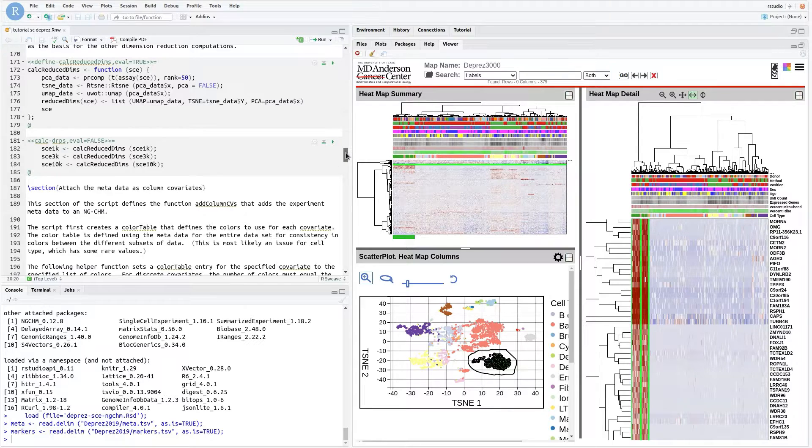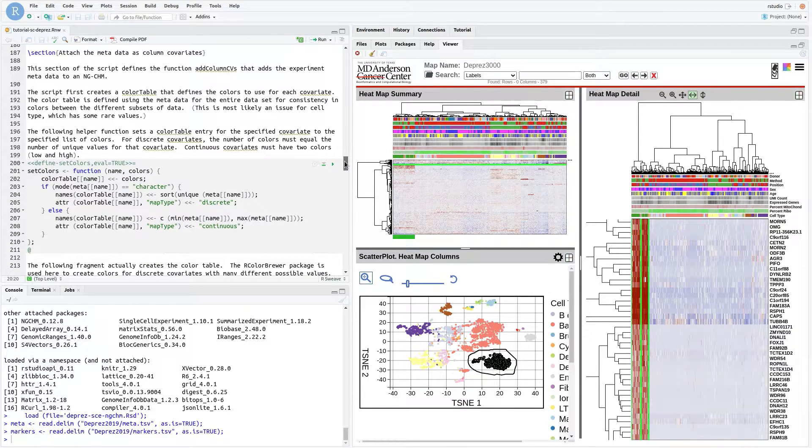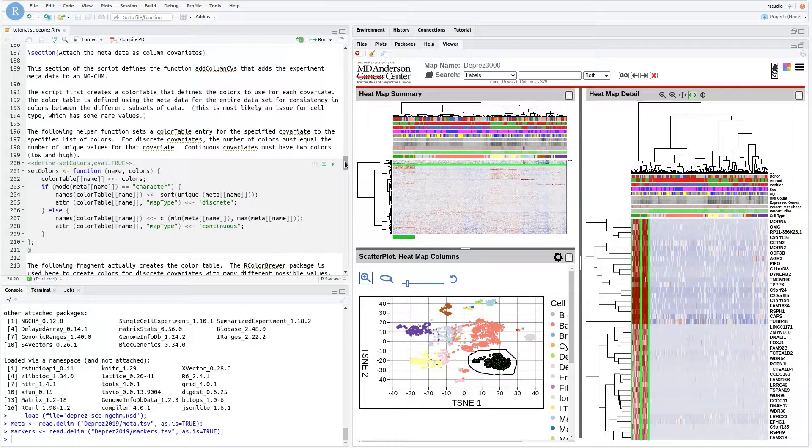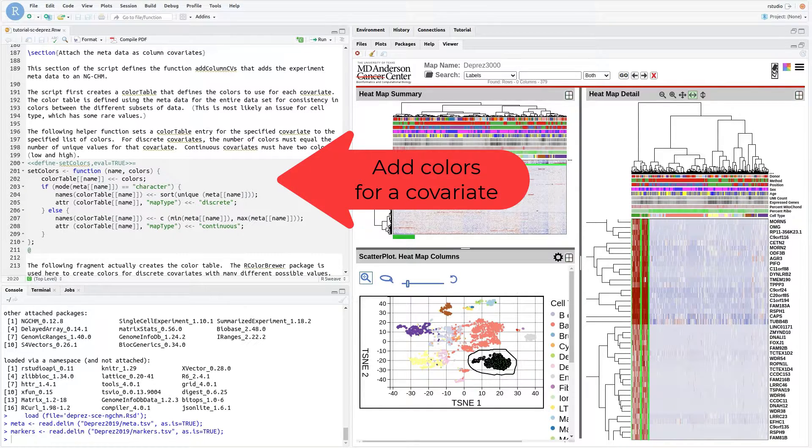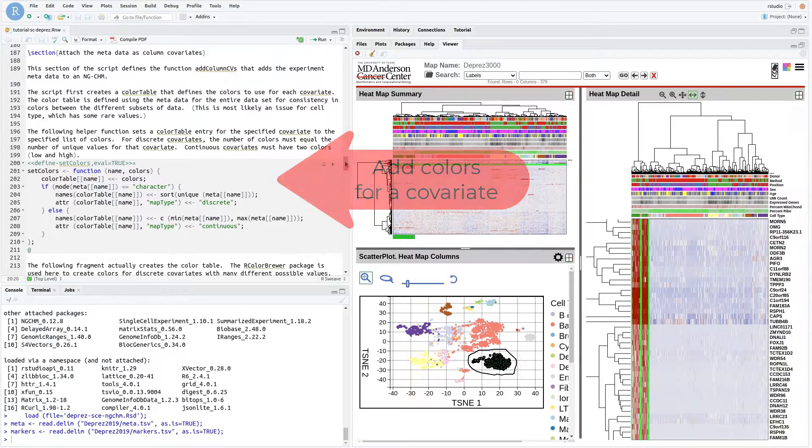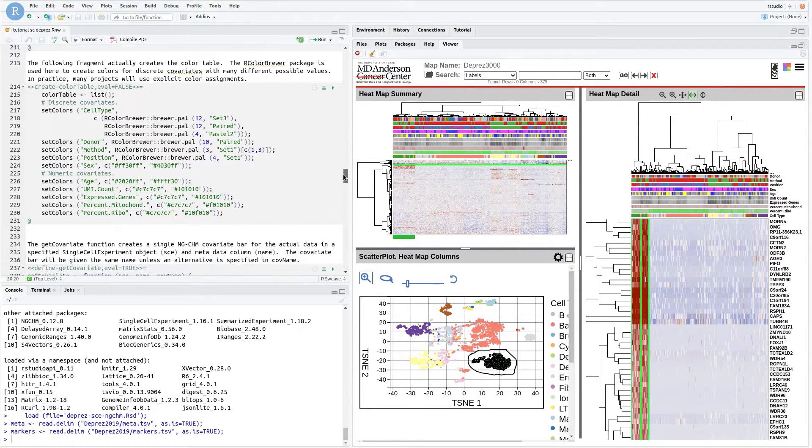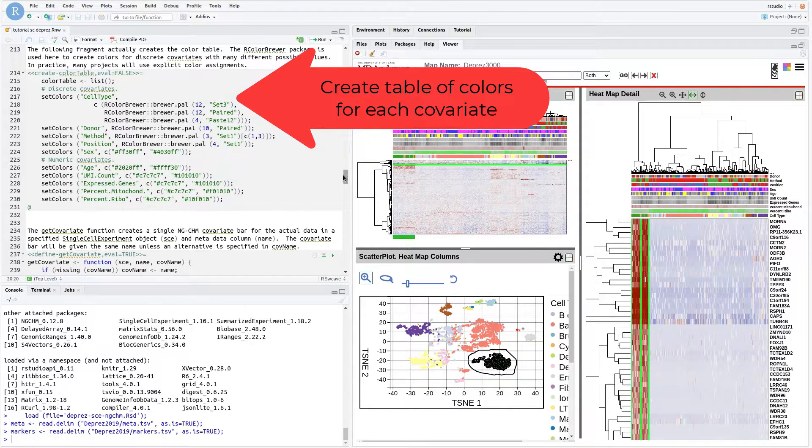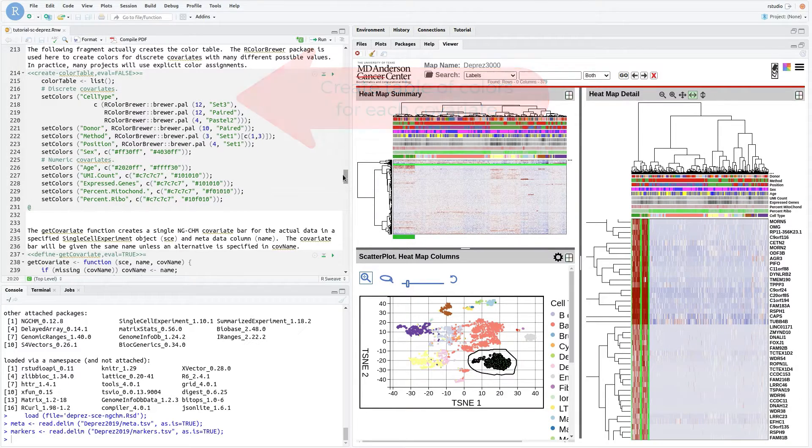This section of the script adds the metadata to the NGCHM as column covariate bars. To avoid a lot of repetition, a simple color table containing the colors to use for each covariate is created. The helper function SetColors adds an entry to that table for the specified covariate. For simplicity, many of the color ranges are set here using our color brewer. In practice, there will likely be specific color assignments for each value.